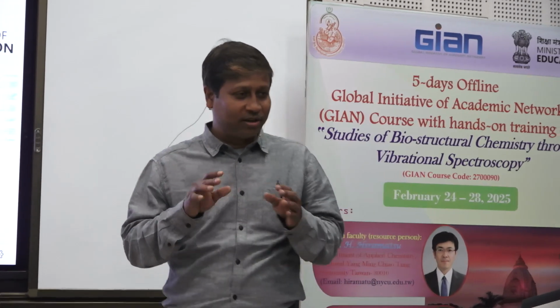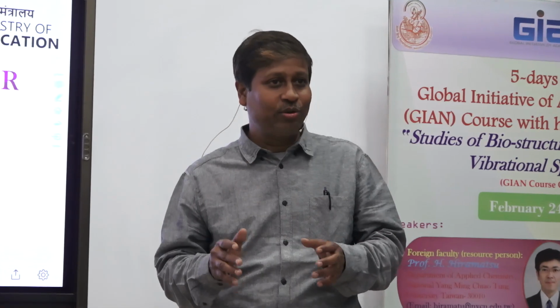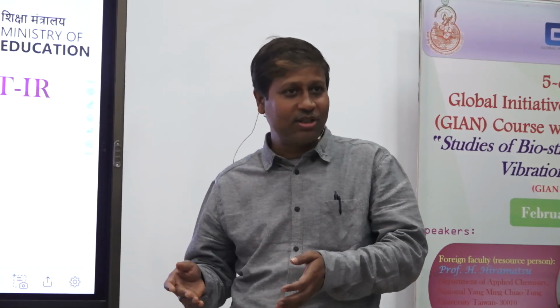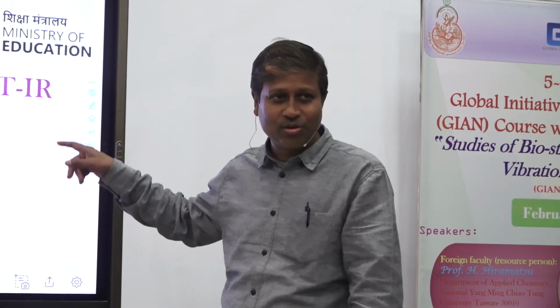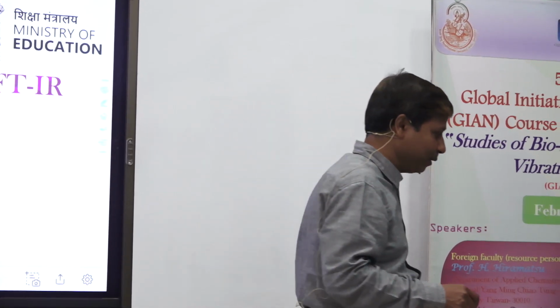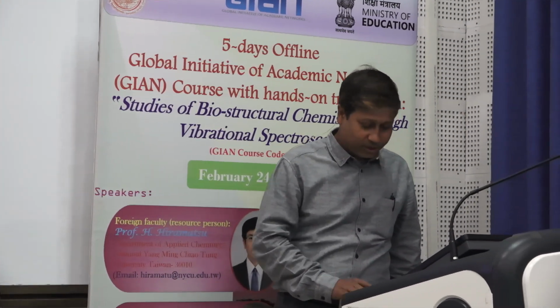You know that we often start with a hypothesis, and then we see that it is not enough to explain the experimental result, and then we change the hypothesis. So that kind of discussion I will do today so that you can have a feeling for spectroscopy. This will be based on FTIR spectroscopy.